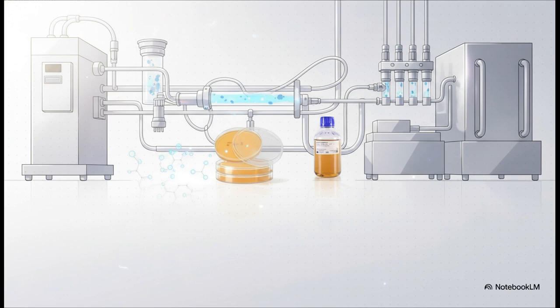You can see that nutrient-rich broth right here. It's Soybean-Casein Digest Medium, usually just called TSB or Tryptic Soy Broth. We substitute this sterile broth for the real drug, and we run it through the exact same tubing, the same filters, and the same filling nozzles as the real product. We just want to see if any contamination manages to sneak in under pressure.